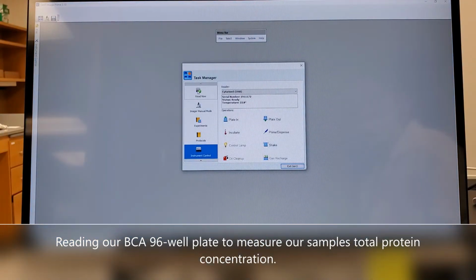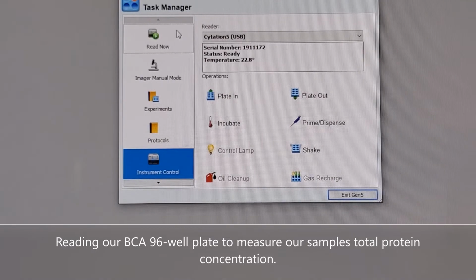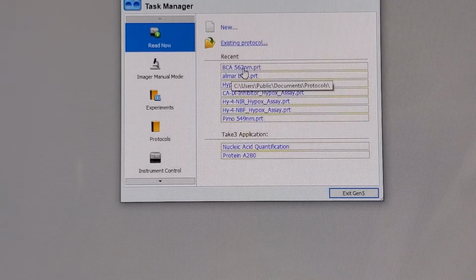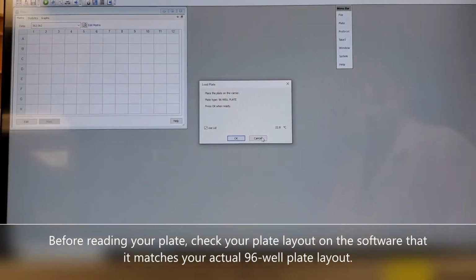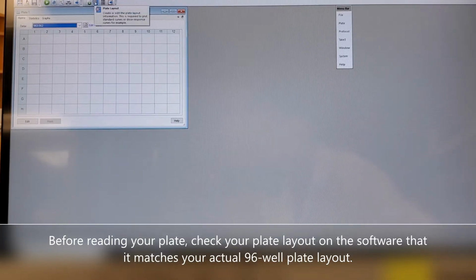And once we are here, go on to where it says read now. Click on read now. And you'll see this window pop out with all our different protocols that we have already written down. I've shown in a previous video how you can read nucleic acid. In our case, we're using this BCA 562 nanometer protocol, so that's the one that we are going to open. Before I click OK, I want to make sure that the setup of the plate matches my setup. I'll check that first. Press cancel. And to check the setup of your plate, you go up here where it says plate layout.